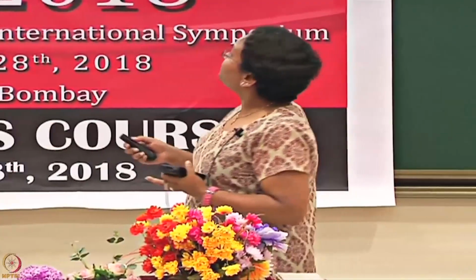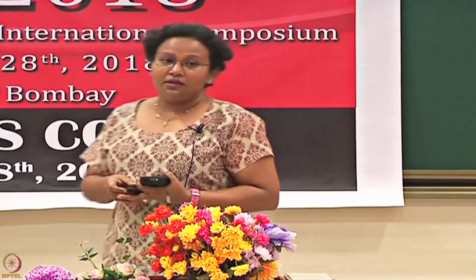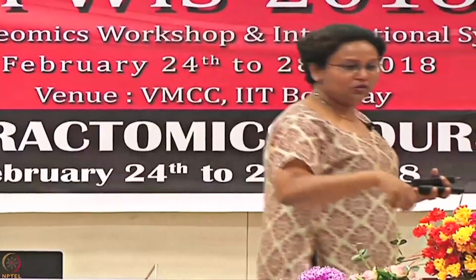Functional groups. Functional groups and binding activity of the immobilized ligand go together actually, because if you are using a functional group to immobilize which is actually in the active pocket, then you destroy the activity, then there is no point, right. So, you need to have some information on the functional group that you are using and that it is not being used to immobilize it on the surface, right.